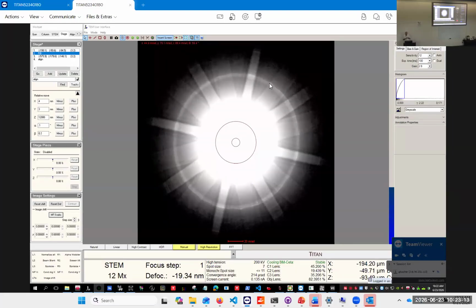And when you have a whole variation of angles, at some point or other, they will actually be exact, and you find very strong correlation. So actually we have here diffraction spots, and only the center ones have this excitation error 0.